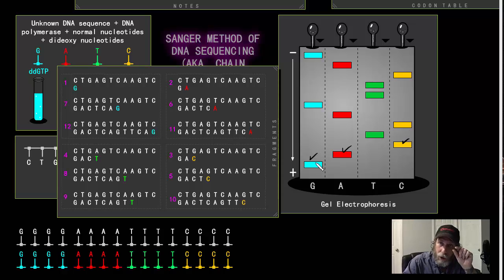This is saying this is the smallest possible piece of the DNA in the test tube with the guanine dideoxynucleotide. So which one was that? Well, it's going to be this one, right? With one base. That means that the first base in the sequence of replicated DNA, this row, now not the original DNA, we'll come back to that in a second, but in the replicated ones, the first base was a guanine. And so we come over here and we write G. All right. In fact, I'm going to switch that over to a lighter color. Let's erase that. I'll write G. Okay. The next base in the gel that went down the next farthest was in the A lane, and so the next base is an A.